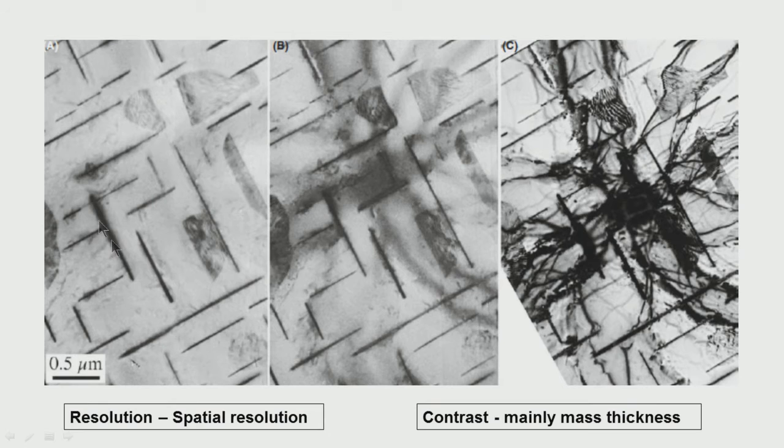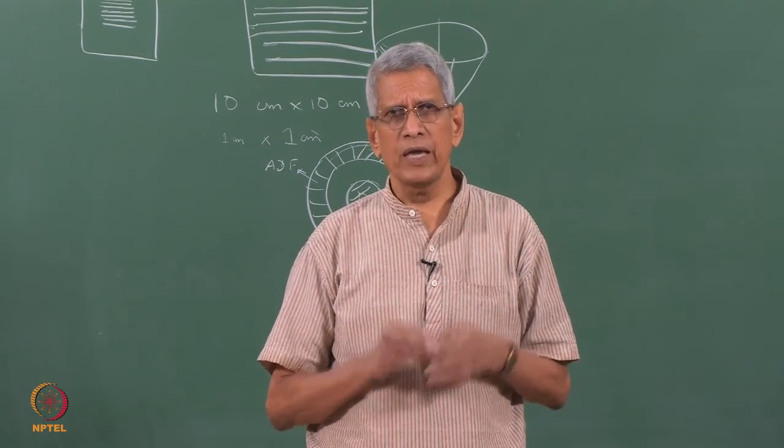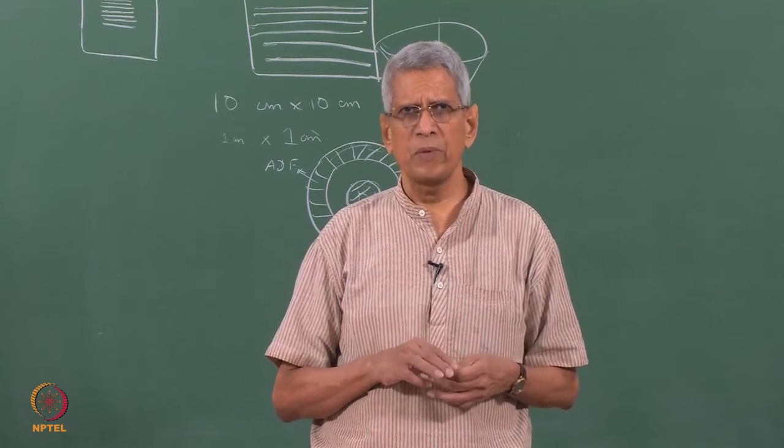Okay. In this particular one, what I am just trying to show essentially is an image which has been taken using scanning transmission electron microscopy as well as the conventional transmission electron microscopy. What one should understand is that in present day microscopes, in the same microscope we can operate it, like if you remember we have talked about earlier a convergent beam diffraction.